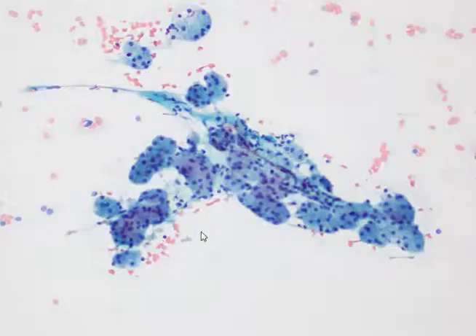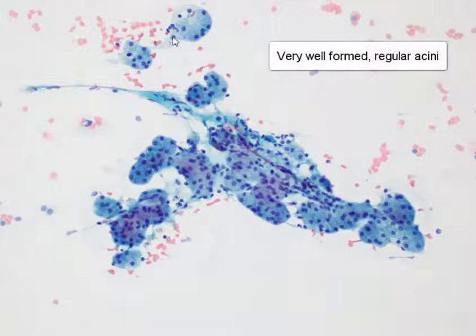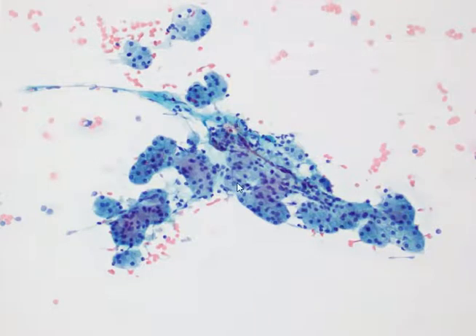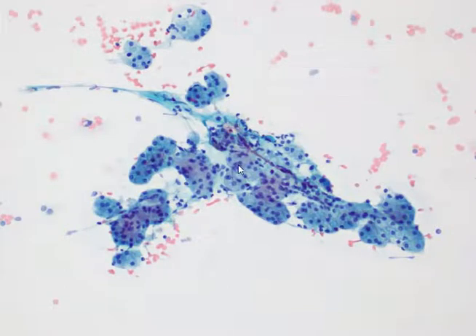Here is normal salivary gland in comparison. What is striking is that the acinar structures are indeed very well-formed — they are extremely round and very sharply outlined or demarcated. Another good clue is that you may sometimes see fibroadipose stroma associated with a tissue fragment, though this is not so clearly seen in this particular field.